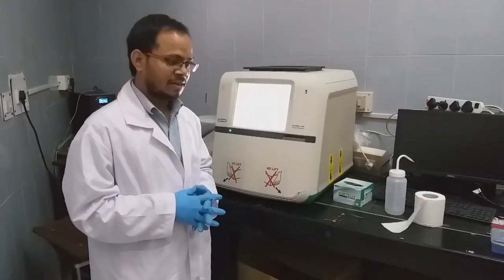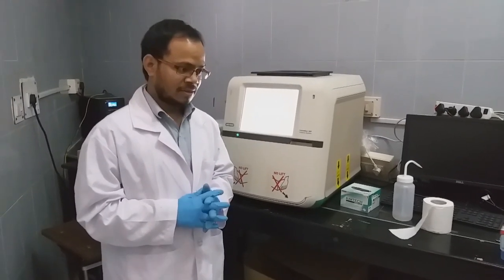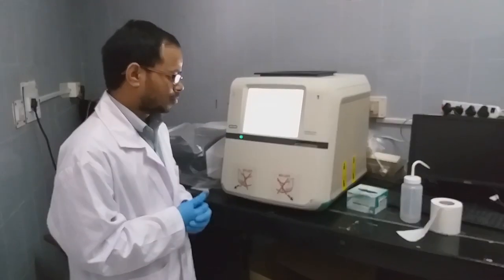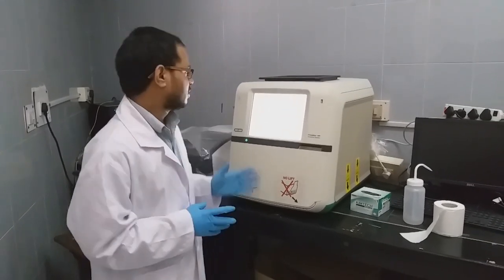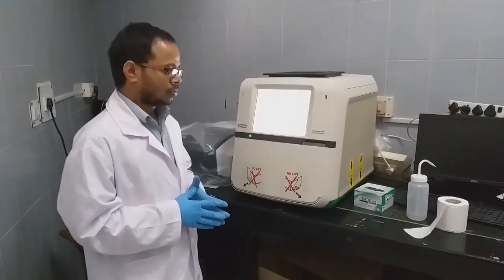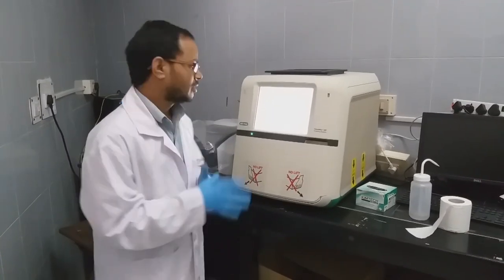We have run the gel and stained and de-stained. Now we will capture the gel image. So we can see manually also, but for record purpose we have to capture it through the gel doc. So this is the gel doc imaging system from Bio-Rad. So I'll show you how to capture the images.